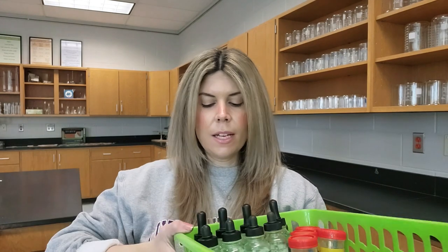This probably comes down to the fact that I was a cart teacher for many years before I got my own classroom, but baskets have made it so much easier to keep things together and put them on the shelf so I can pull them out whenever I need. One of my favorite baskets is sitting right here — I already started prepping the lab and have some of my reagents in it. This is a basket from Dollar Tree. As teachers, we don't have a lot of money to spend, and Dollar Tree has some pretty nice stuff for really cheap — about a dollar. I love the fun colors. I've had these baskets for close to four or five years, and use them all the time for lab setups and equipment transport. You can't put really heavy stuff in them — they're a little on the flimsier side — but they're perfect for storing solid reagent chemicals or having a lab setup in the tray for students.